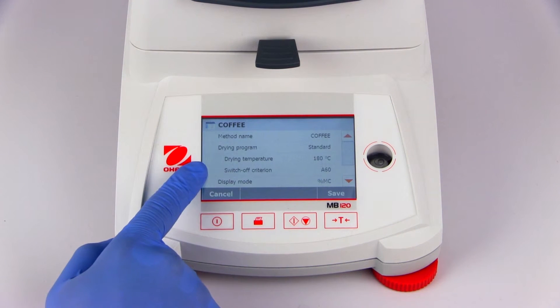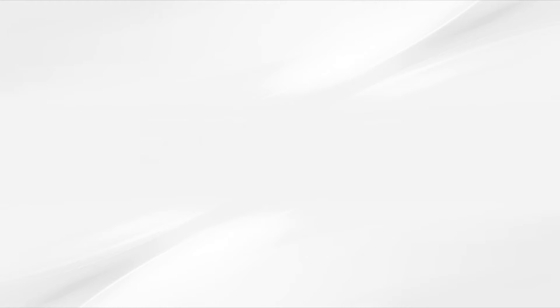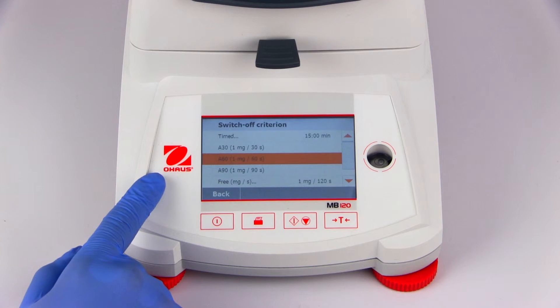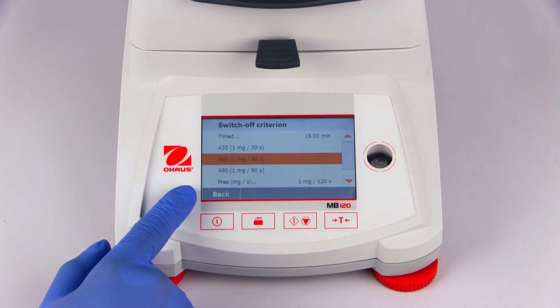The next parameter is to set the shutoff criterion. A shutoff criterion defines when the moisture analyzer stops heating and considers a measurement complete. This can be done by defining a time or via several automatic options that are available. The MB120 Moisture Analyzer offers three built-in automatic shutoff criteria and two user-configurable options.